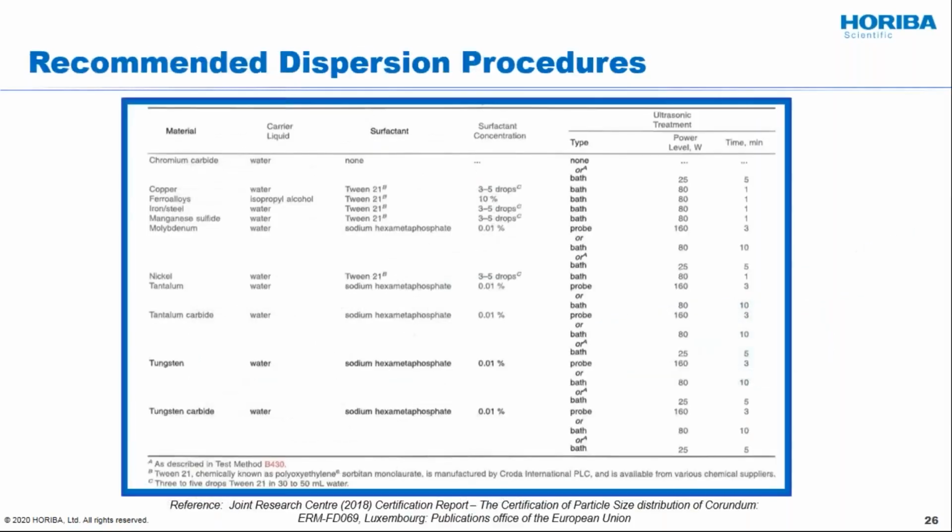Now, as we mentioned earlier, if you go out in the literature, if you belong to ASTM or some other trade organization, what you're going to find is these people have figured this out already. So rather than you reinventing the wheel, you just go here. Now, again, these are examples from B9, powdered metals. Probably most of you are not doing these, but just use it as an example.